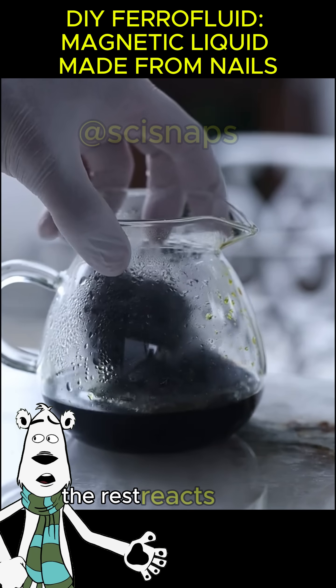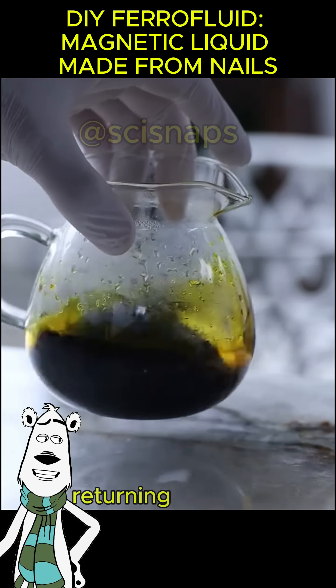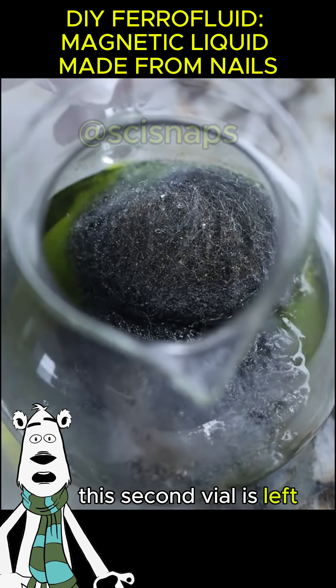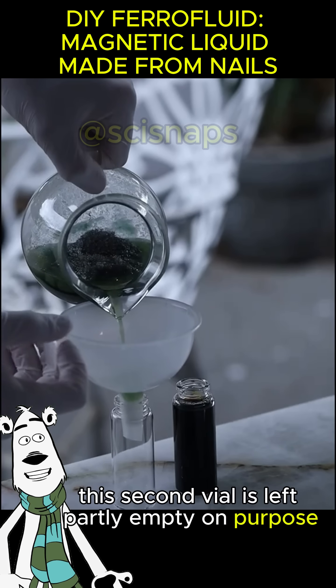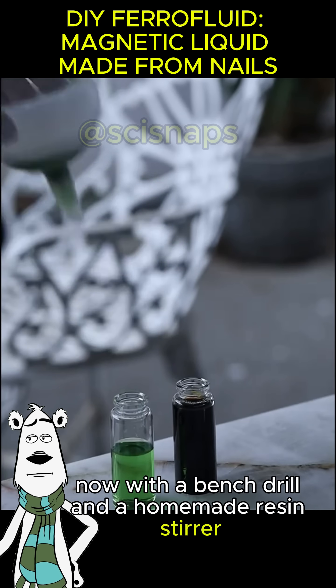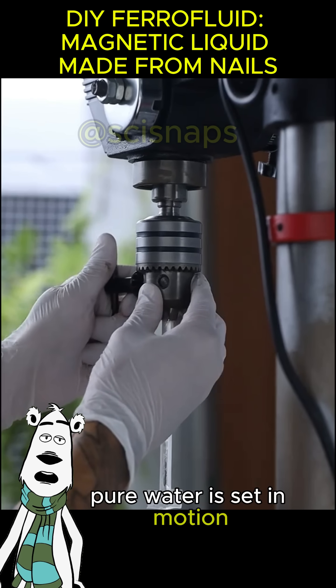Once cooled, part of the ferric chloride is stored in a small vial. The rest reacts with steel wool, returning to the green ferrous state. This second vial is left partly empty on purpose. Now, with a bench drill and a homemade resin stirrer, pure water is set in motion.